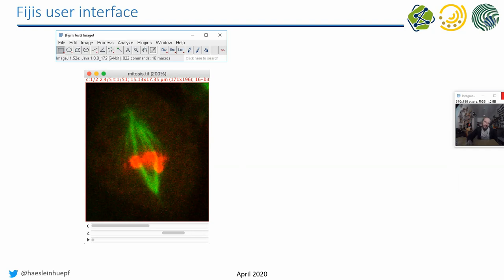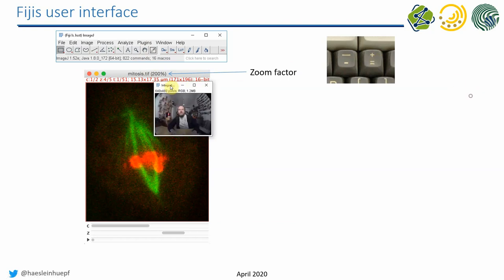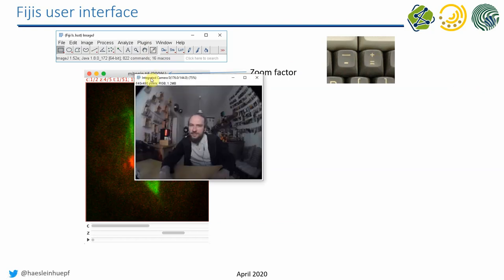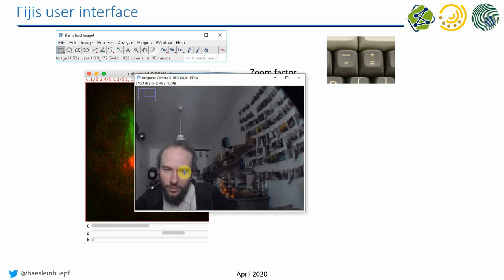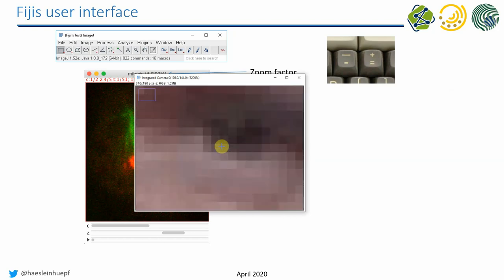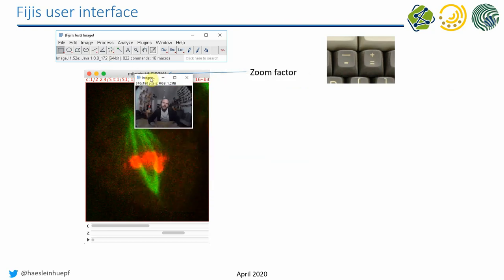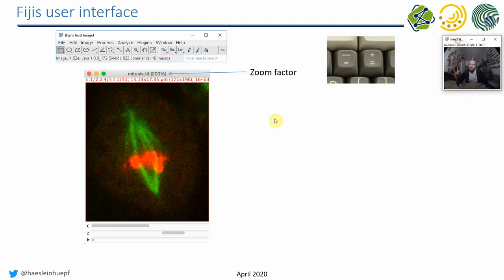The Fiji image window contains a lot of information. You can see the zoom factor — how enlarged the image is on your screen — and use the minus and plus keys to zoom. You can press the plus key to increase the window, and the position of the mouse matters when zooming in further. This is something many people learn late, so it's worth knowing now.